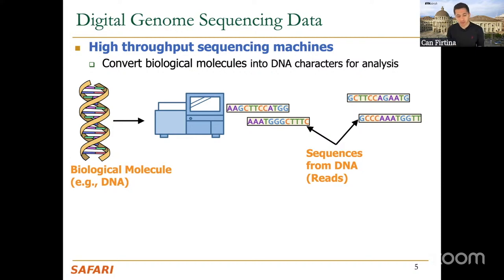So to simplify it in your mind, you can just think of it as the fragmented molecule that is read by a sequencer as one piece. That is a read, essentially. I'm clarifying this because I've got several questions in the past about this, and it's not necessarily clear in the field, and it's not necessarily clarified in the field to explain what it is.